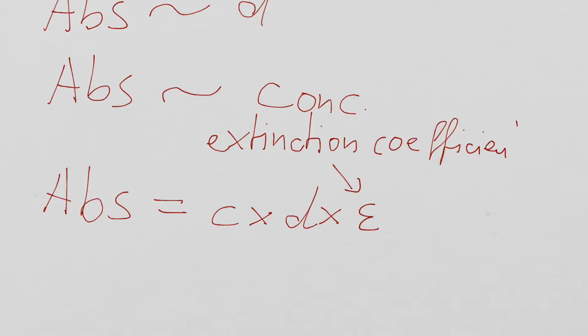So that's the extinction coefficient, and this extinction coefficient is dependent on the substance, it's dependent on the environment of the substance, and it depends on the wavelength of the light or the energy that we're using.